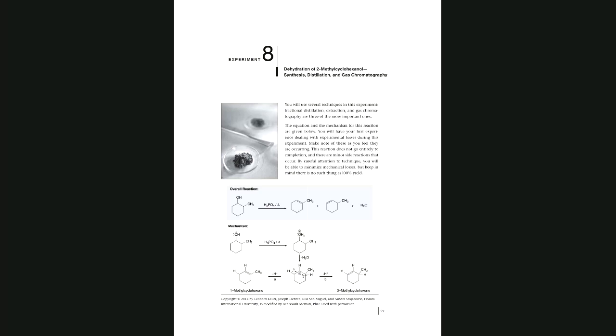Any questions? So we are waiting for the distillation to take place. I can increase it to around 70, and as soon as I see it's boiling, I would lower the temperature. I need to get about 8 to 9 milliliters of the product.